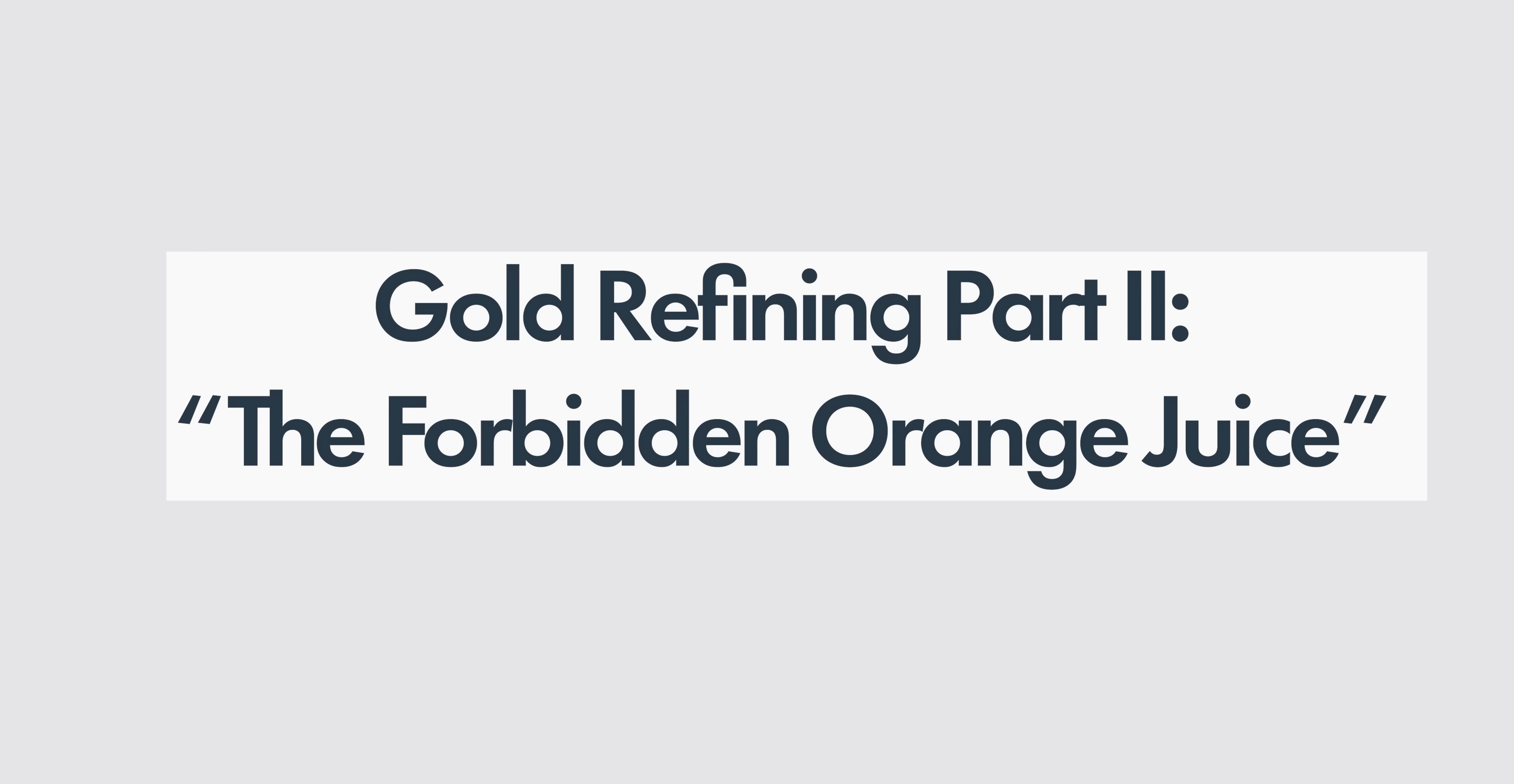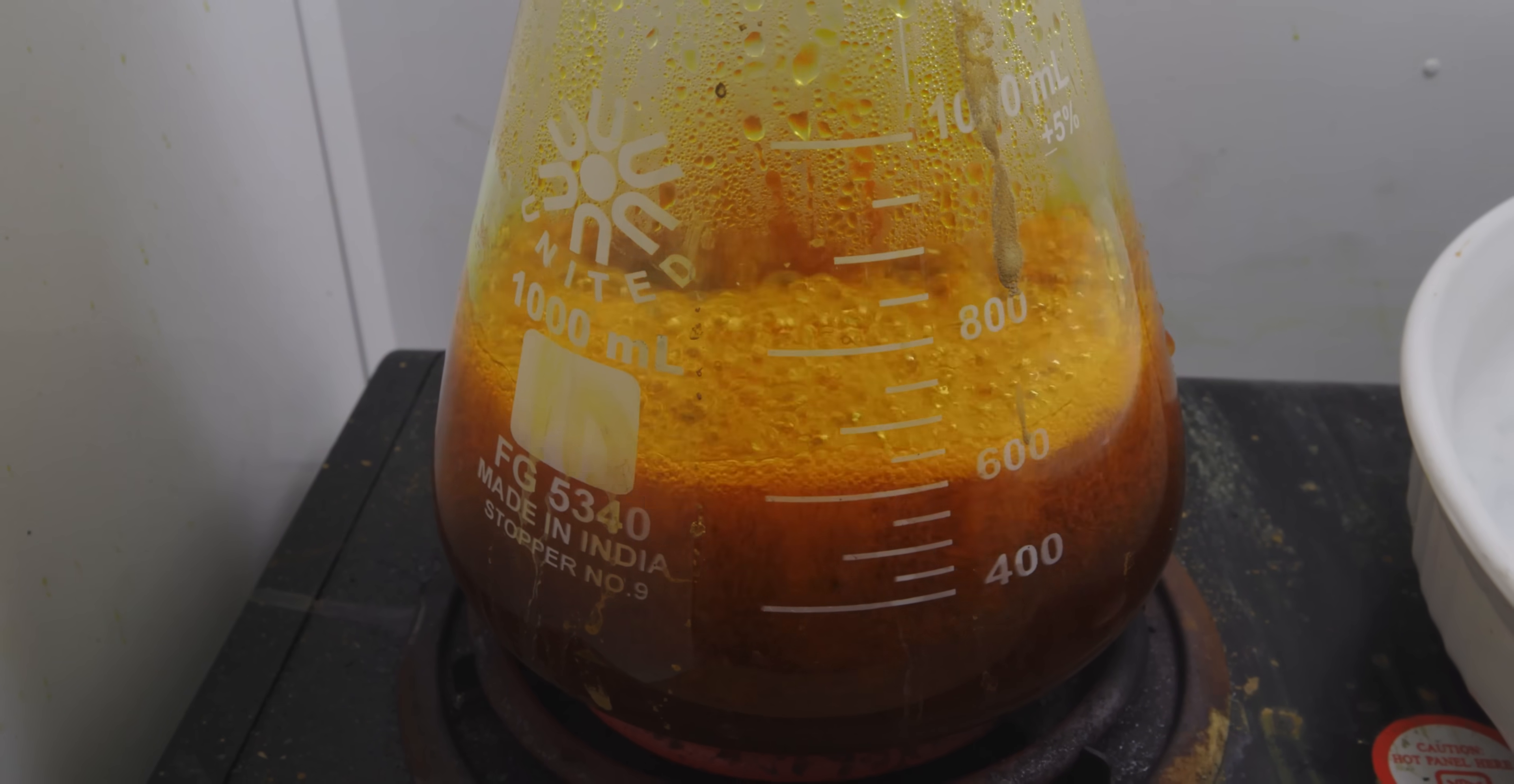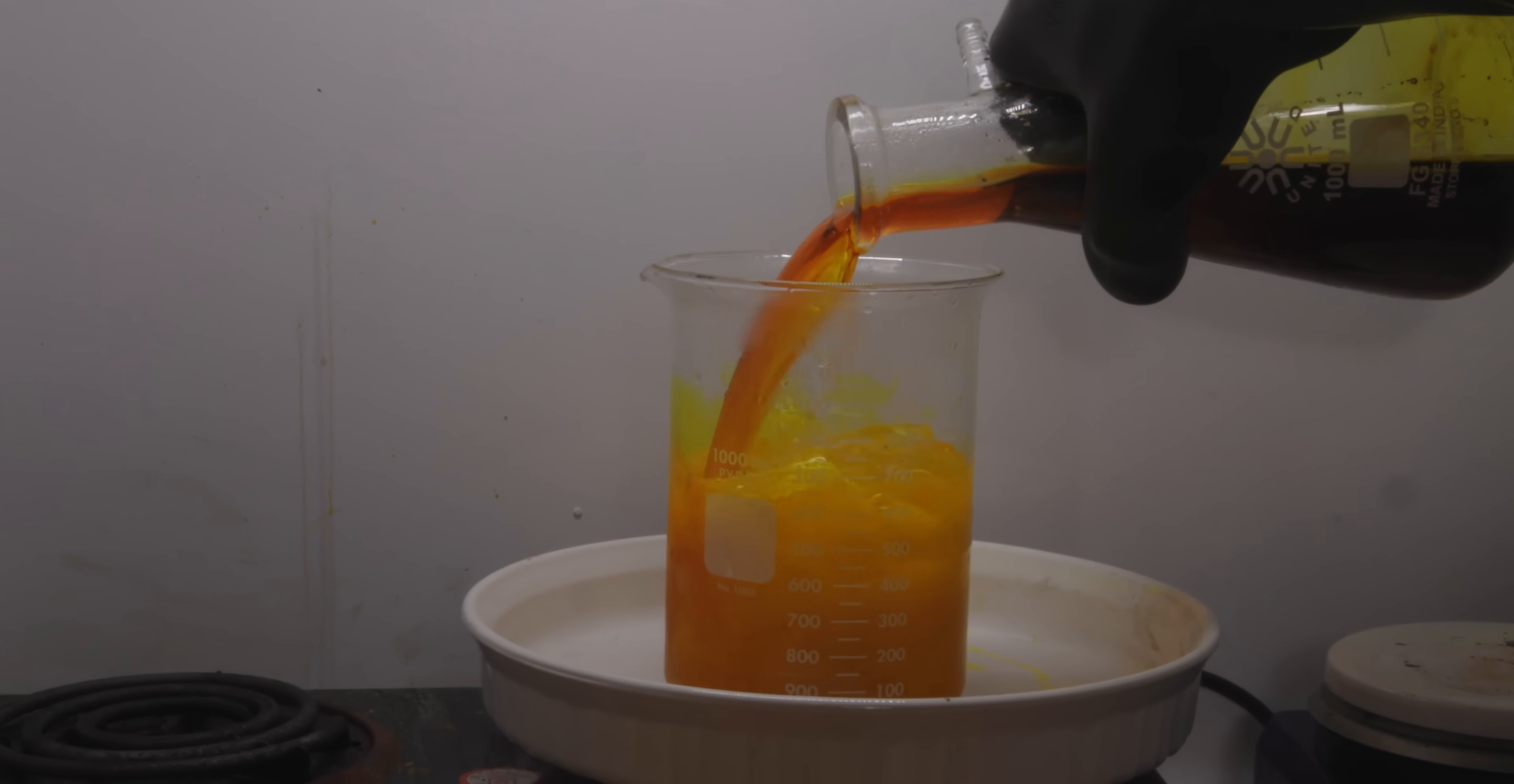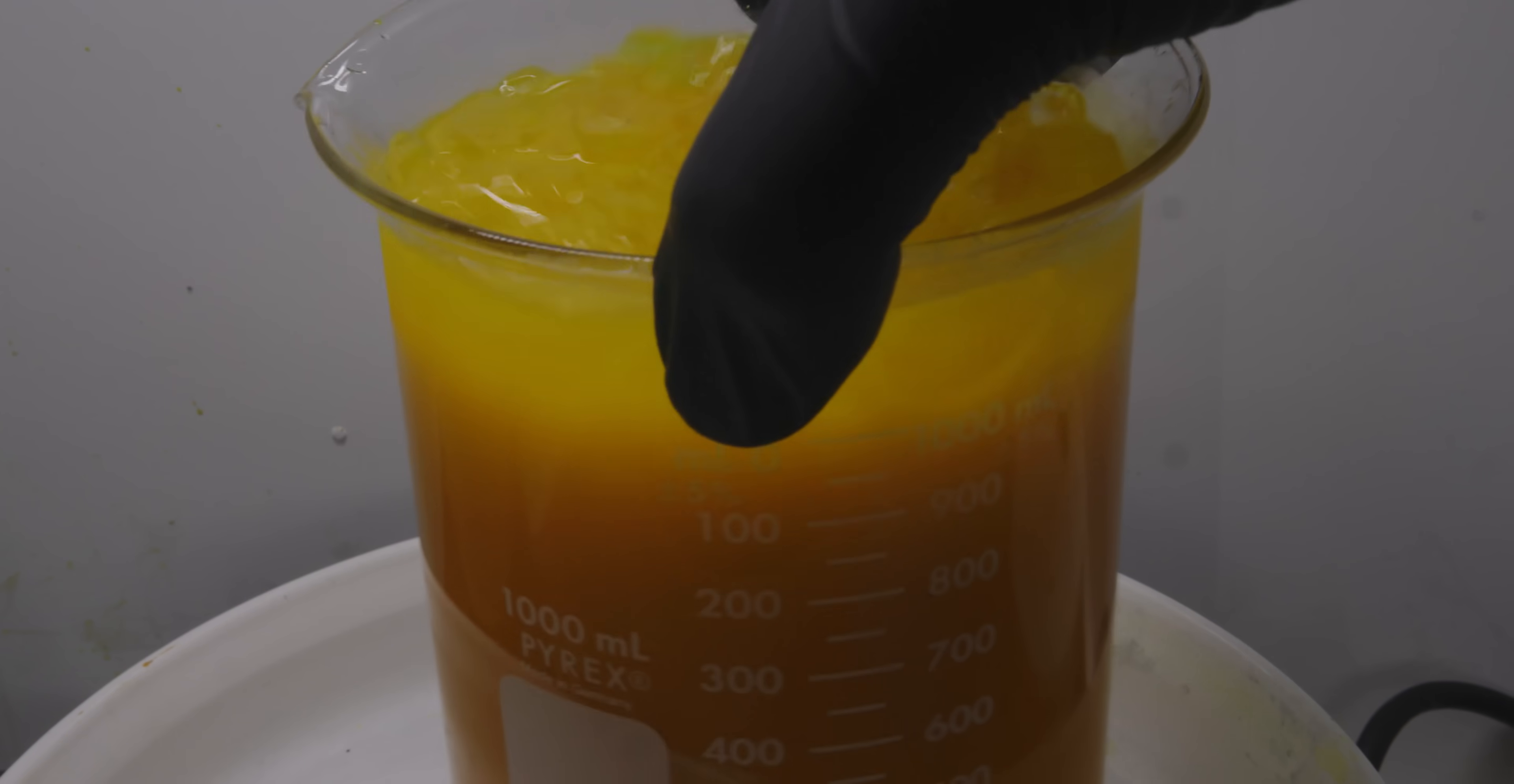Introducing gold refining part 2, the forbidden orange juice. I'm kicking things off with the ever-familiar Aquaregia. But the reaction, it looks different this time. It has beautiful deep and rich orange colors. And the gold mud, well, it put up no fight in dissolving quickly. Pouring it over ice, I give you forbidden orange juice. You can see there was some silver chloride left over, which validates my decision to repeat this refining process.